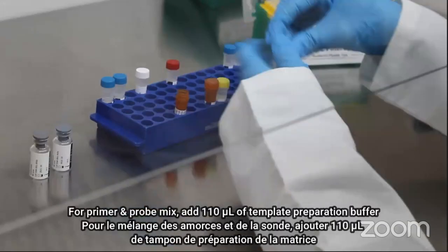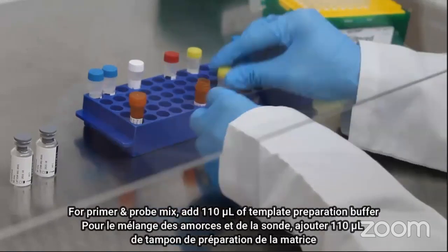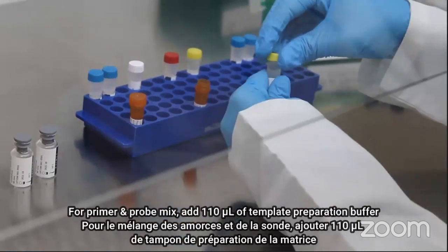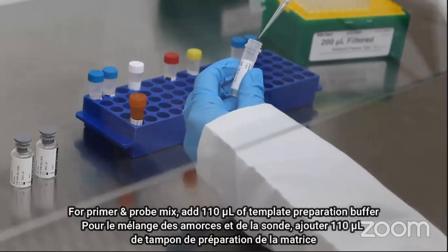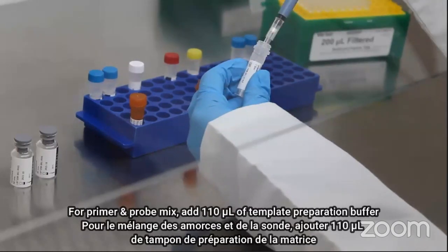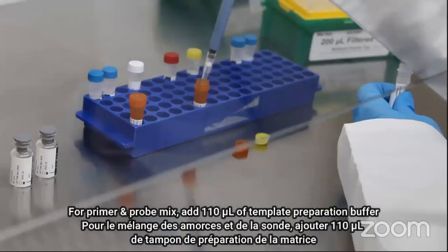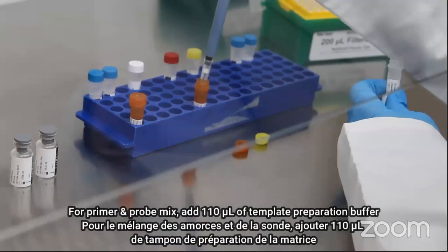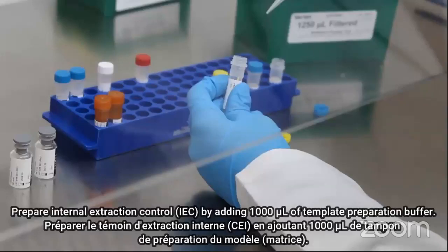Then for the primer and probe mix, add 110 microliters of template preparation buffer, that is the yellow cap tube. Mix it gently, be careful because this is sensitive to light. Please don't pipette it harshly because it can result in degradation of the probe. So mix it gently. There are 2 amber colored tubes for primer probe mix.